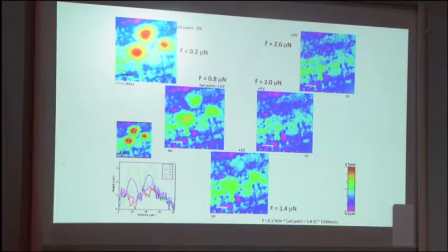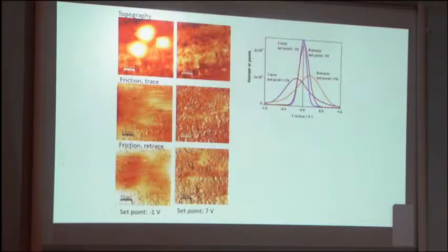This is like lithography, but it is possible to investigate mechanical stability and how cells interact with different substrates, and how we apply normal force and scanning, press on the lateral scale, move cells and determine the adhesion.